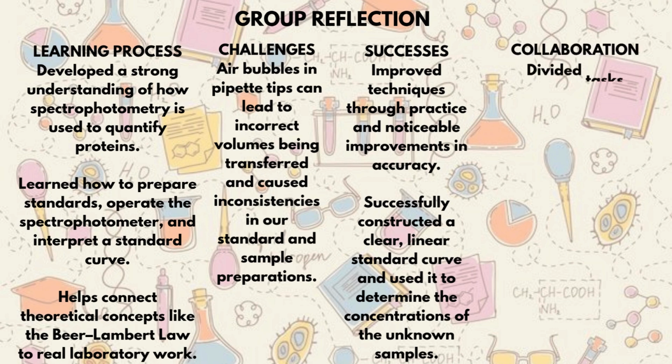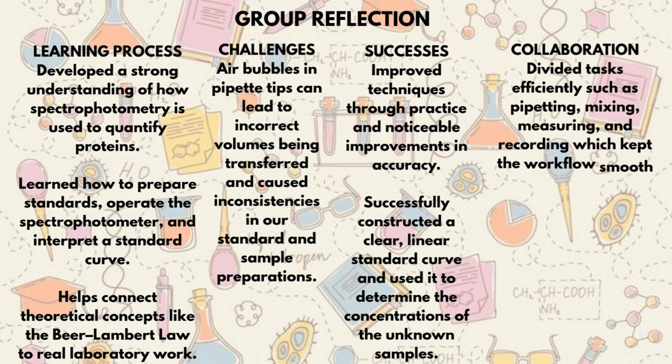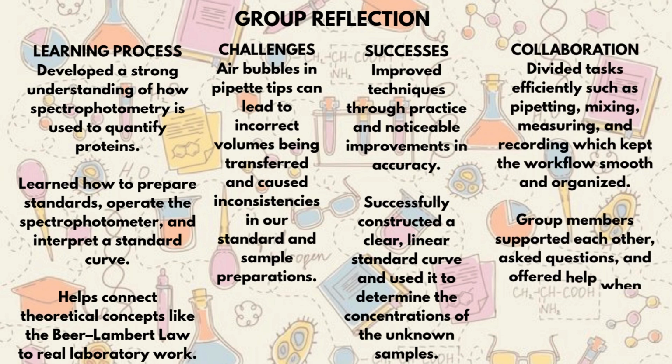During the practical, we also divided tasks efficiently, such as pipetting, mixing, measuring, and recording, which kept the workflow smooth and organized. Group members supported each other, asked questions, and offered help when needed.